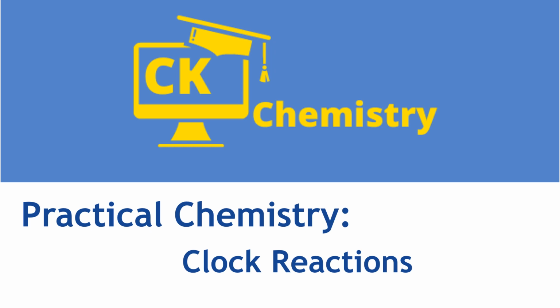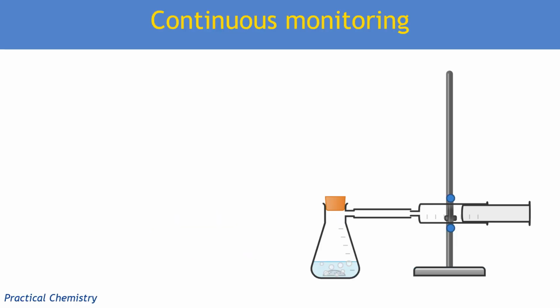This month's practical chemistry focus, we are going to look at clock reactions and how we use them in rates of reaction experiments to find out orders or to find out activation energy by changing temperature. So before we get into what a clock reaction is, let's talk about what it isn't.